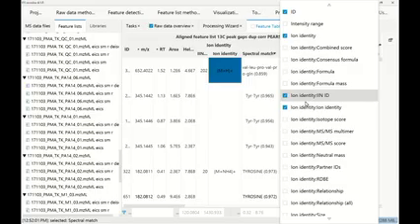If you program, you could program your own module and work on any kind of data in MZmine. And we also provide, of course, export, where we export the data that we have. Not all of it, right? Because it's quite hard to format everything as text, but we export most of the data that we have and that people wanted in different text formats that you can use, like a CSV format, for example.